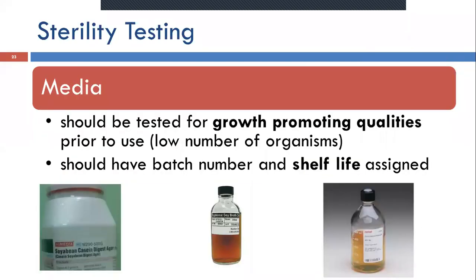So this is regarding the sterility testing: what the requirements are, what precautions have to be taken, and what sort of media should be used.